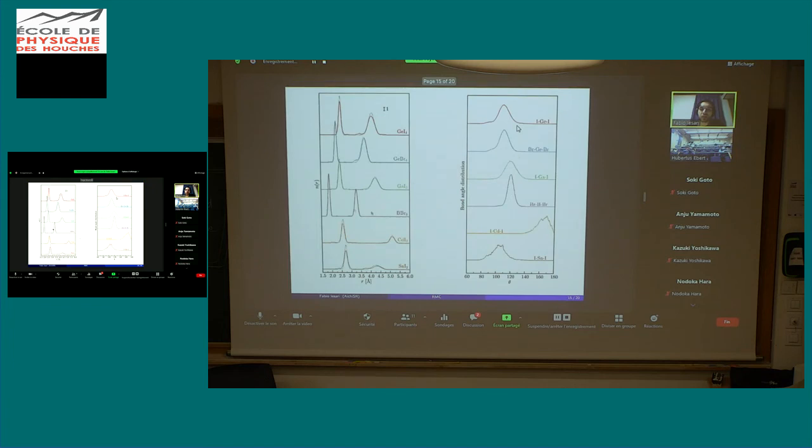And what we obtain is the pair distribution function for the various molecules compared with some electron diffraction measurements. Sometimes there is some difference in the height because the electron diffraction experiments were taken from the literature and are sometimes at different temperature with respect to our GNXAS experiment.